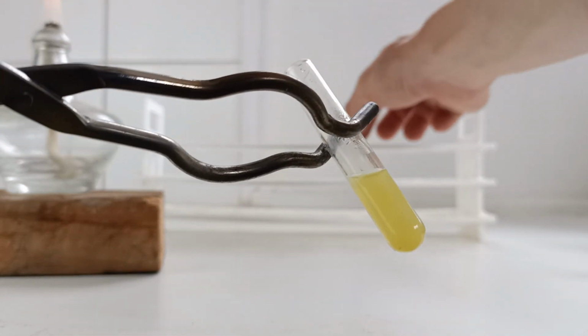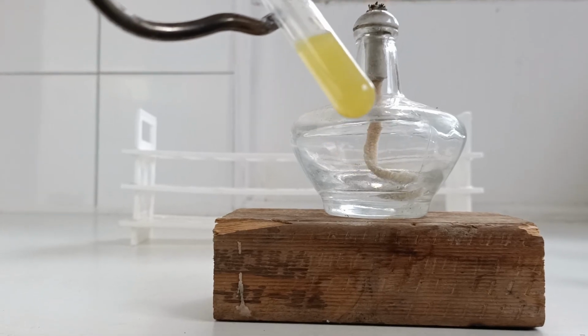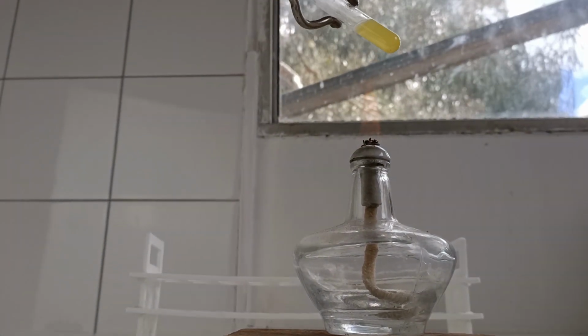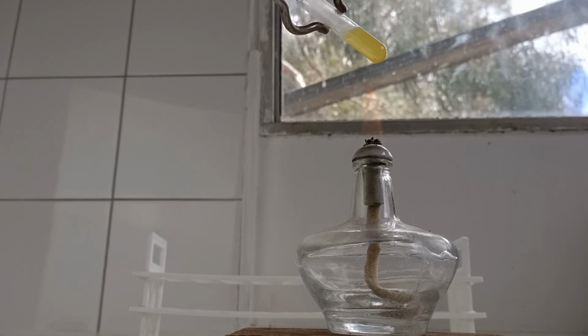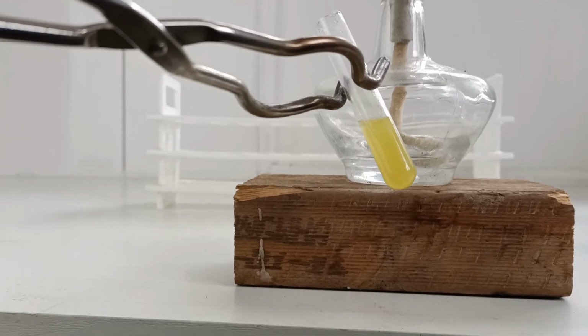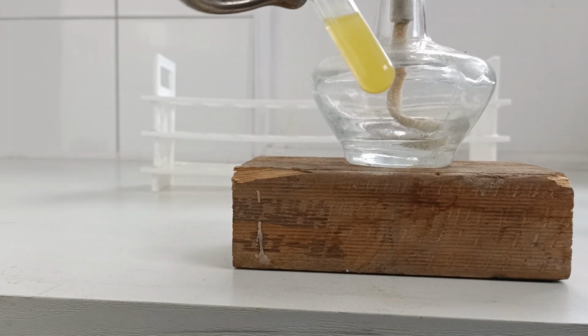You can actually heat that up a little bit. I shall just pivot you up. Warm it up a bit, we should get a bit more. There we go. Nice canary yellow, positive for phosphate.